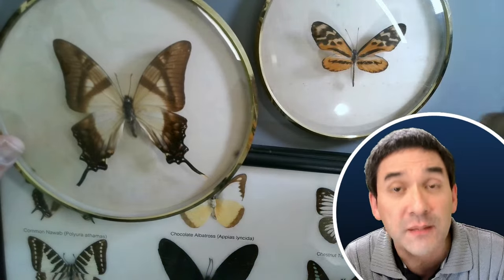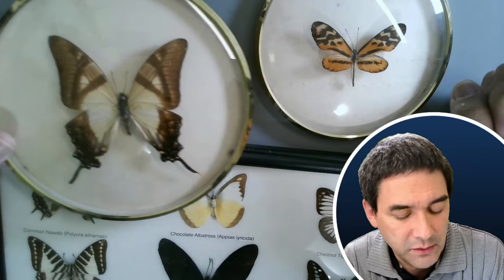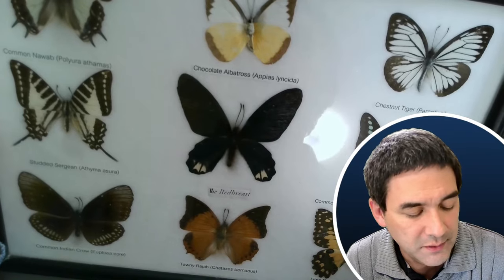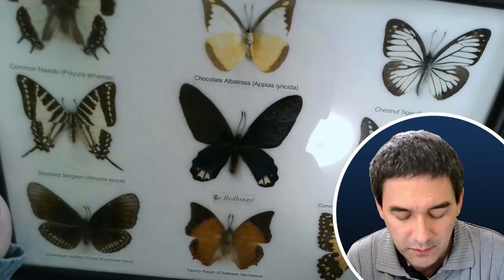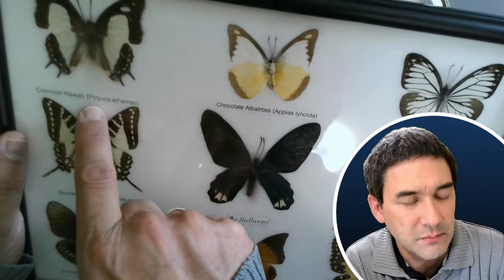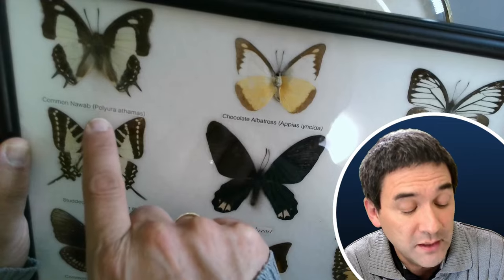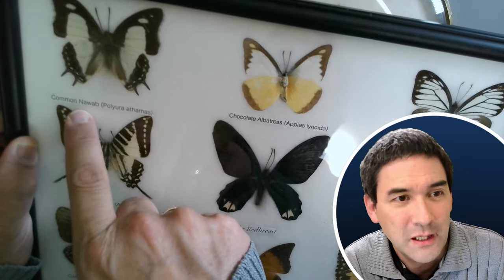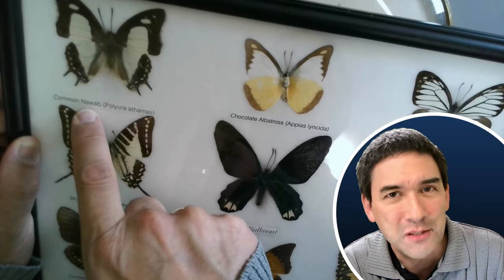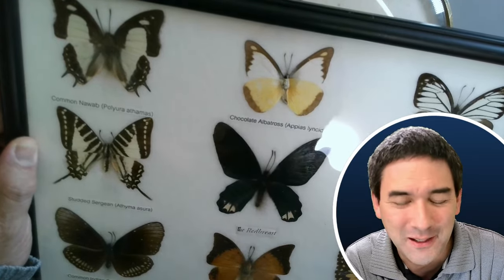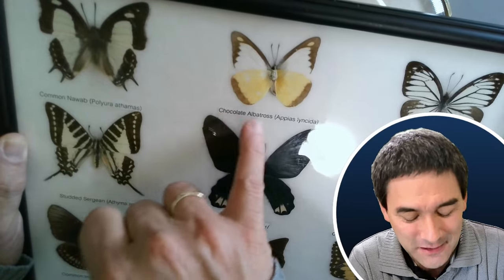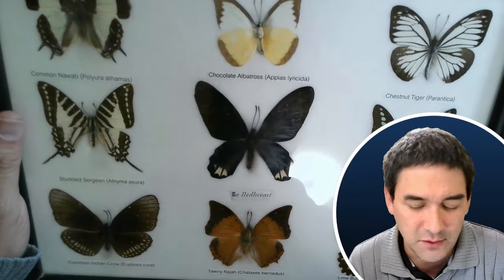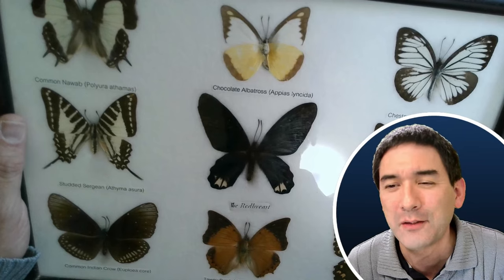I would like to show you how to do some image stacking — some focus stacking — using these butterflies. There are some scientific names here, but I have my doubts whether they are actually correct. The species name should always be written in lowercase letters and italicized. But it doesn't matter — they will look great under the microscope in any case.